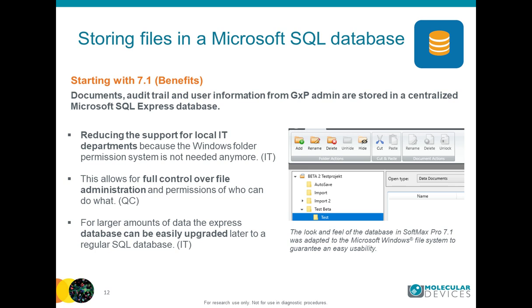But the benefits of storing files in a database are actually striking. Because in previous versions, the files were stored in a Windows file-based system. You had to apply third-party tools to monitor renaming of the files, deletion, and also moving. By storing files in the database, you can keep complete control over files that are being deleted, and you can set permissions to delete files.